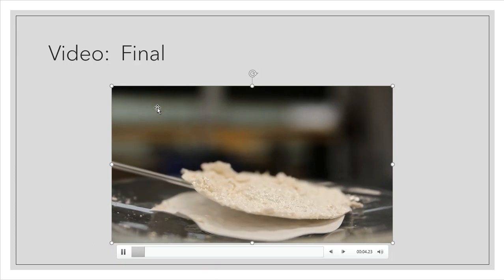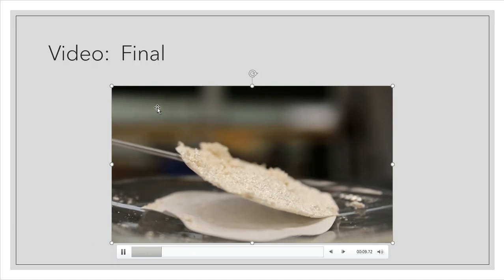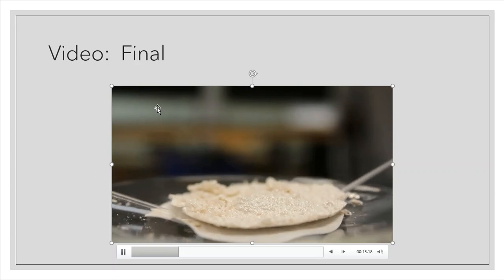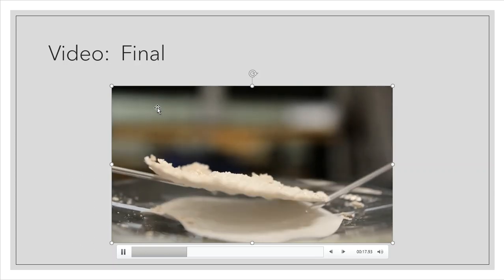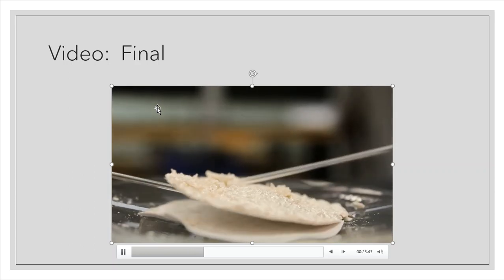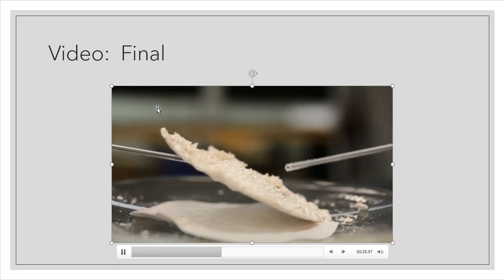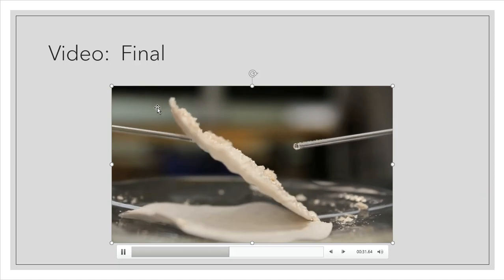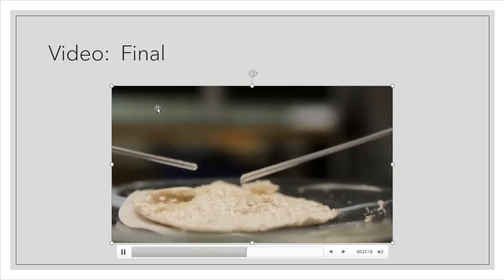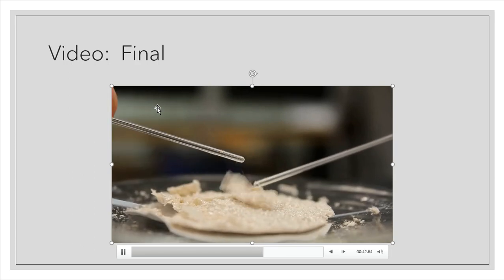So here's the final product of the trans-cinnamic acid edition. The reason I'm doing this video is because look at the crystals. Yeah, they're all stuck together. It's like one big mass crystal chunk. And this is a kind of common of what we're seeing right now in some of the laboratory experiments that we're doing and that we're talking about. But folks, this is not a very common occurrence at all. You know, most of the time these crystals are individual, these crystals are very loose, but this is in one big mass chunk. So I'm just going to kind of break it and snap it if I can, and you can see how brittle and how hard that this product actually is.